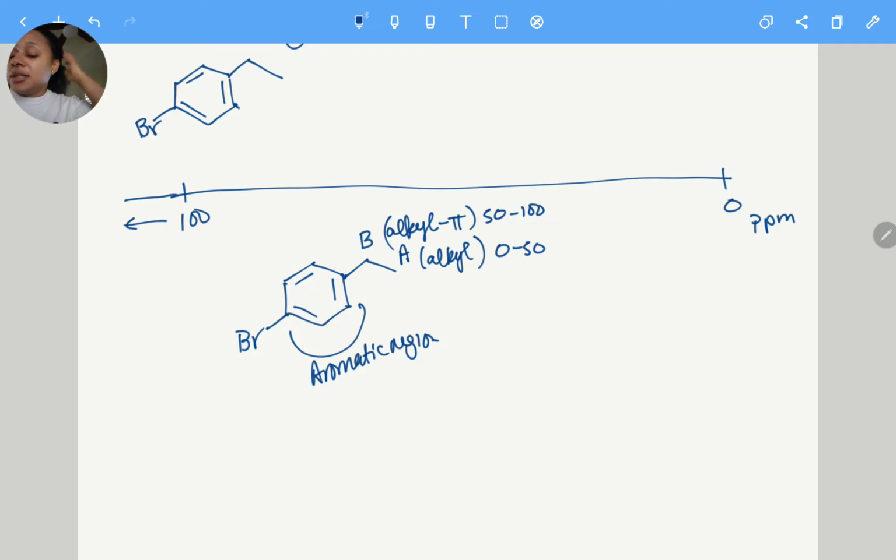And then the aromatics, there is this peak. That carbon would be C. There's no other carbon attached to an ethyl group, so it's itself. But these two are identical. They're seeing the same environment. So this is D and D. I mean, could you tell one from the other if you rotated the molecule? No. And then E, same thing. And then there's nothing else with a bromine on there. So I see that I have 1, 2, 3, 4, 5, 6 signals.